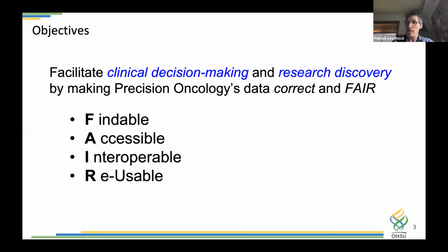So let's actually take a look at some screenshots and some examples of how data is used to do precision oncology at the Knight Cancer Institute. So we're pulling all the data from around campus and from different labs, storing it, integrating it in LabKey. Let's suppose we want to have a patient-centric view of the data.